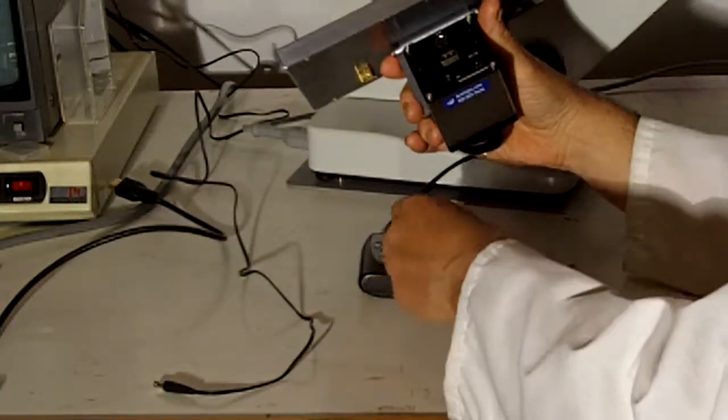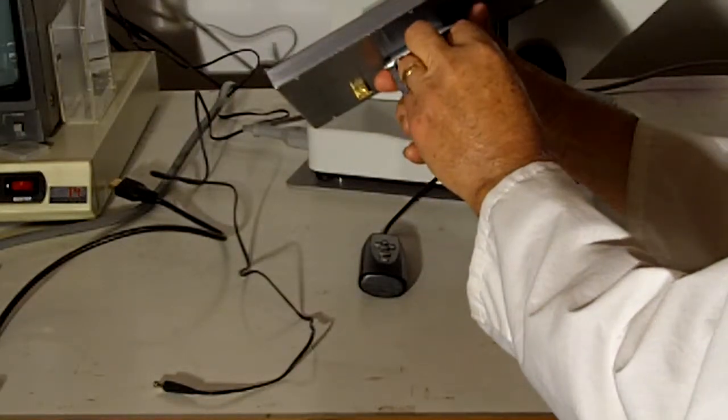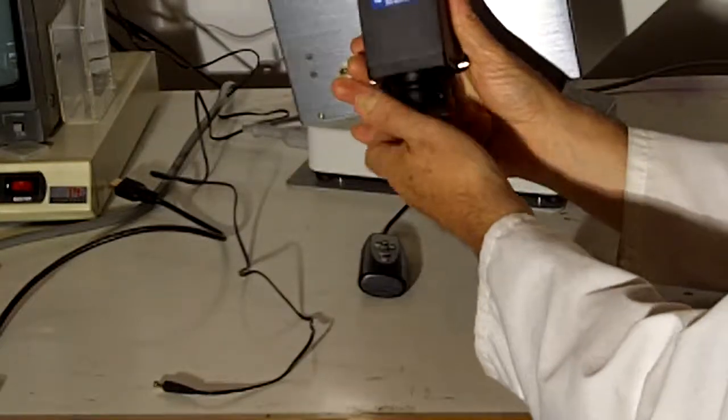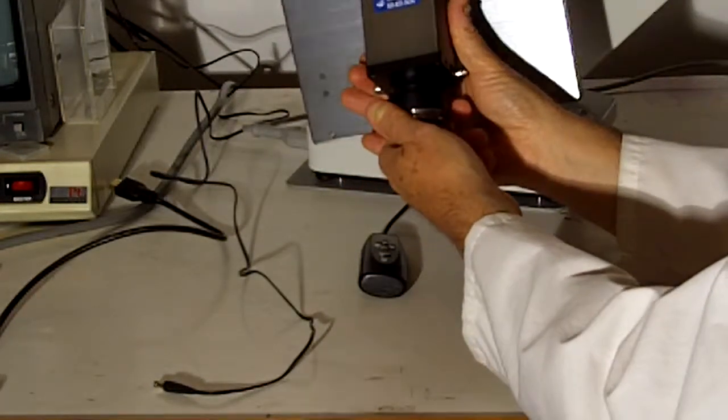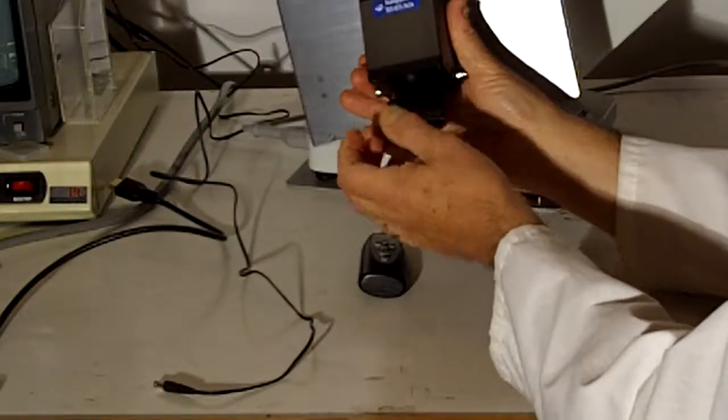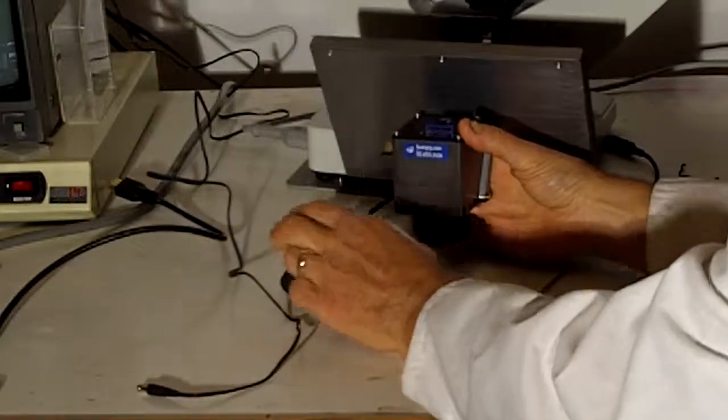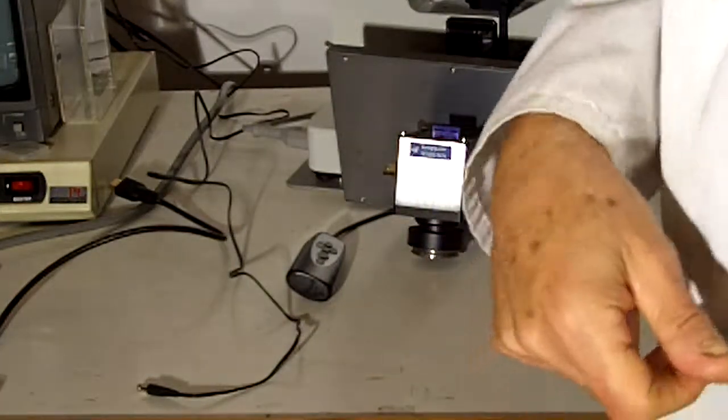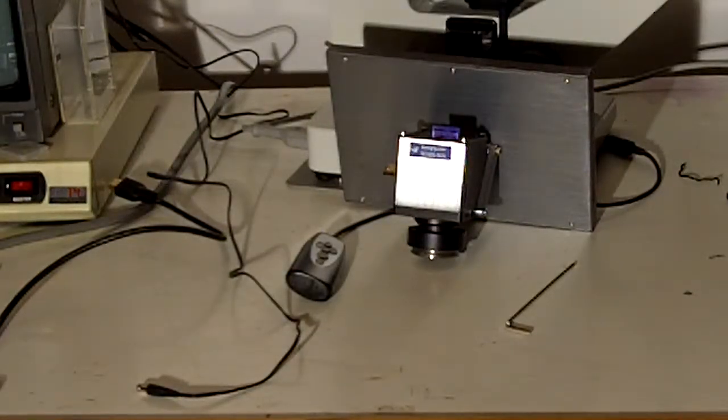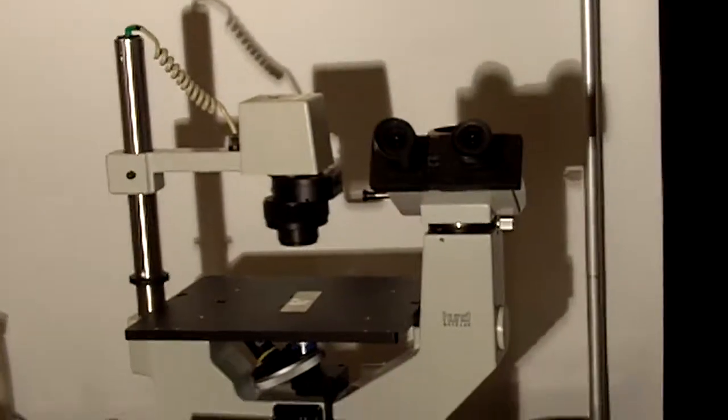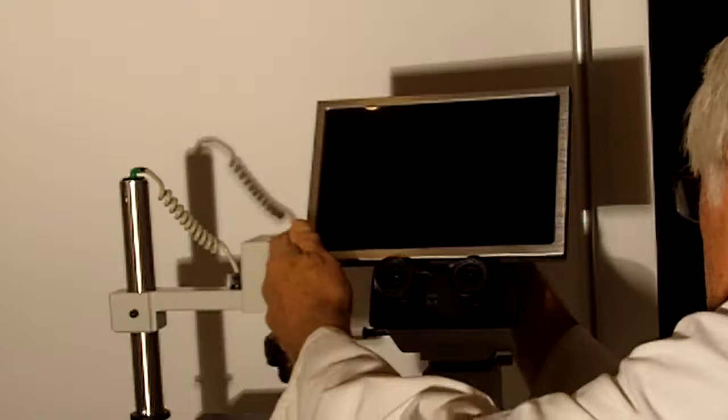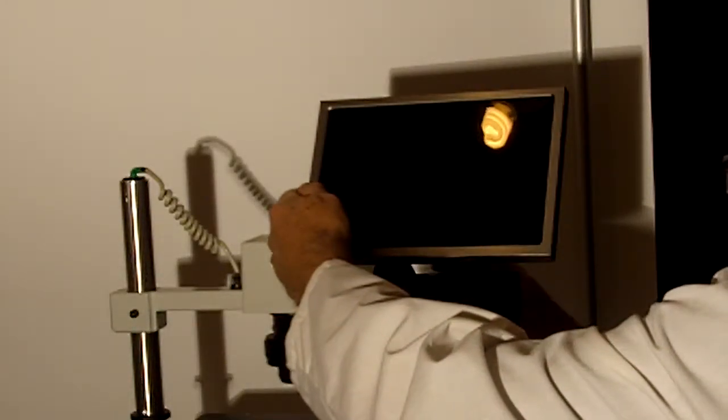Once set up, it's a simple connection to your C-mount adapter on your microscope. This is a C-mount 0.5x for this particular microscope that we'll be working with. I'm going to adjust my filming camera quickly to include the camera port, and we'll take a look at some imagery on this particular Hund inverted microscope setup for phase contrast.